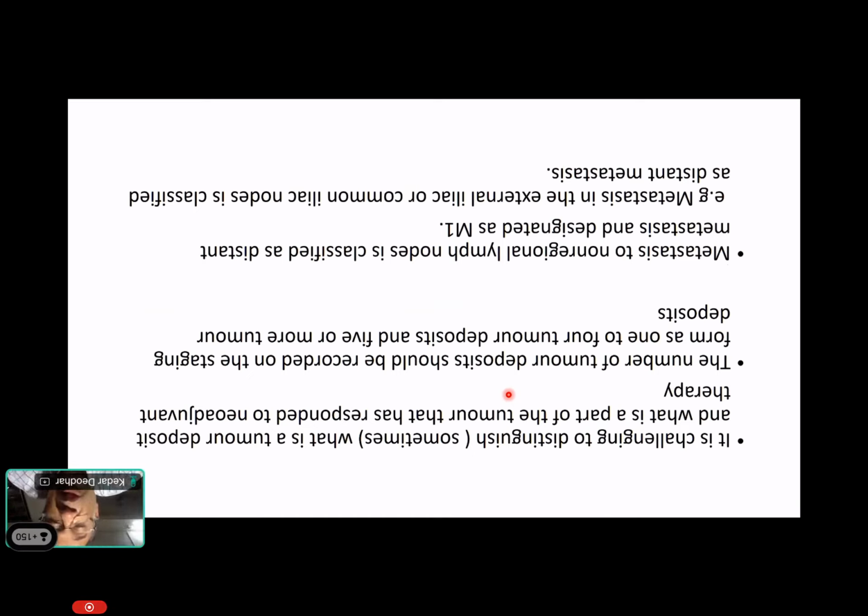By and large, in the area of tumor, we call it a tumor, and depending on the size or location, we call it T1, T2, or T3, ypT1 or pT1, pT2 or pT3. I think that's probably also to conclude regarding the colorectal cancer specimen.